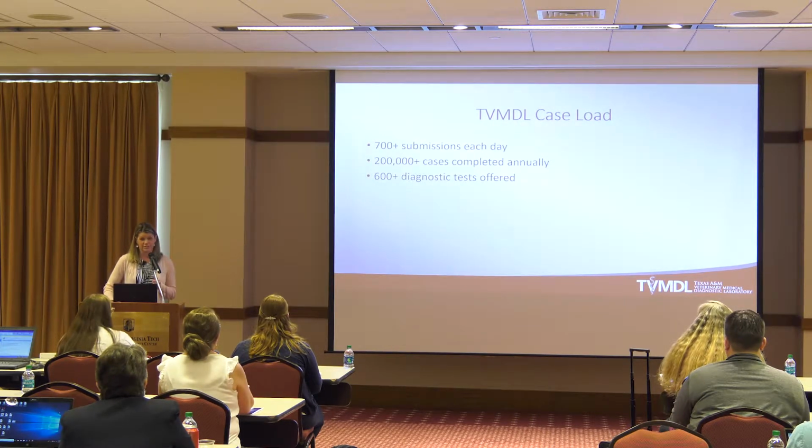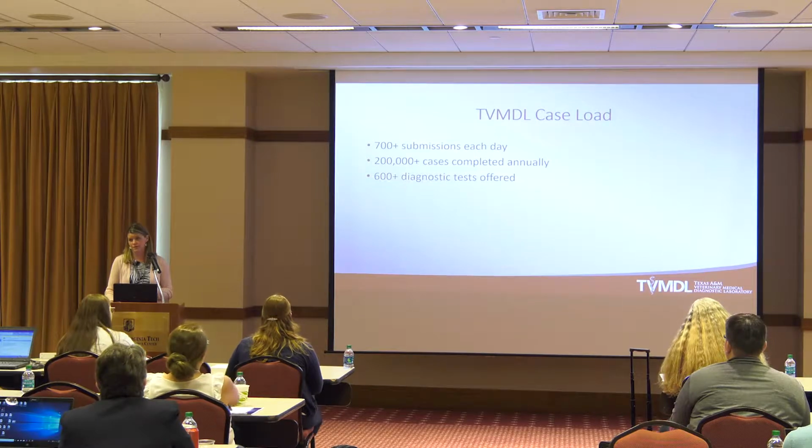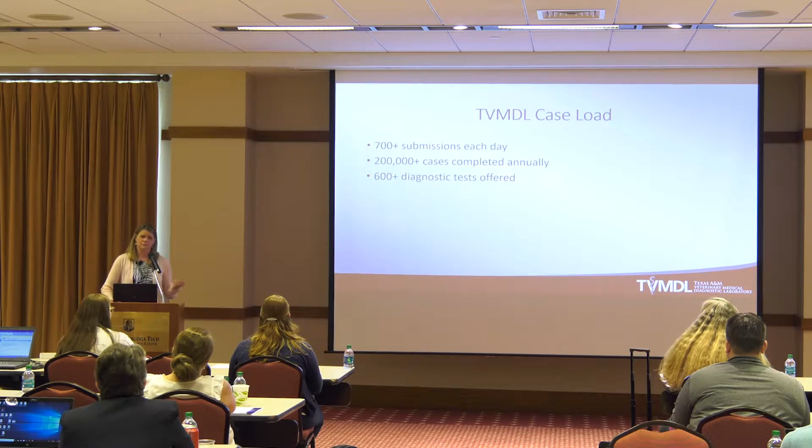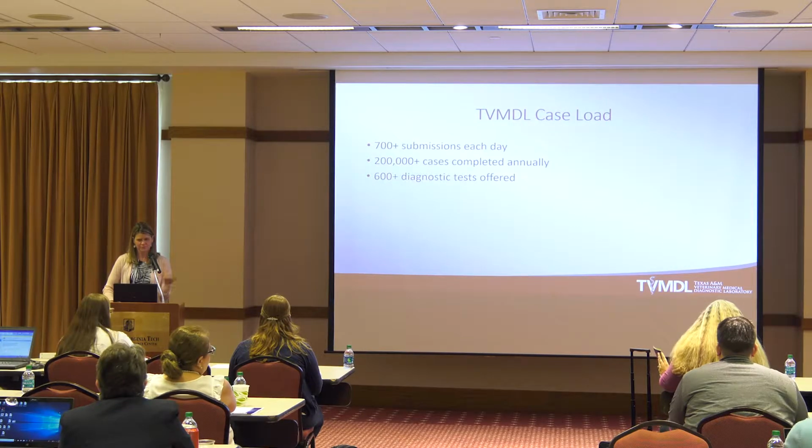We have about 700 submissions a day. Our clients are all over the state of Texas, throughout the country, and even throughout the world. We get about 700 submissions a day, could have multiple specimens. We do over 200,000 cases a year. And we offer over 600 diagnostic tests. So just a background of what we do and what we're trying to do every day. You can see with these numbers of cases worked and these number of tests, it's really important to have a very solid quality management system, because we want to make sure that what we're producing is quality work. And when it goes out to our clients, we want accurate, reliable results.